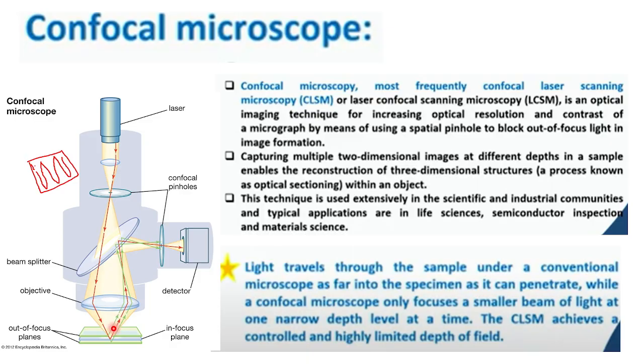Yes, actually, this is showing light from different layers. For example, red is coming from the second, the green is first, and the last one is also green. So this is from different depths of your material. The reflected light is from different depths of your material. To make it easier to identify, that's why it is showing green, red, and green. The first one is from the initial slice, and if you cut the first slice, then the red is coming from the second slice. That means it is the depth profile. That's why it is making different colors.